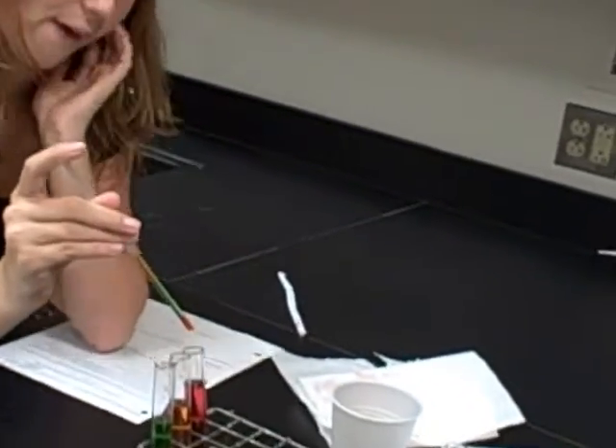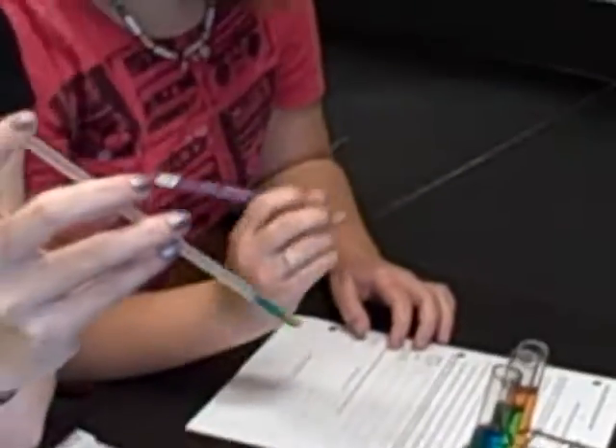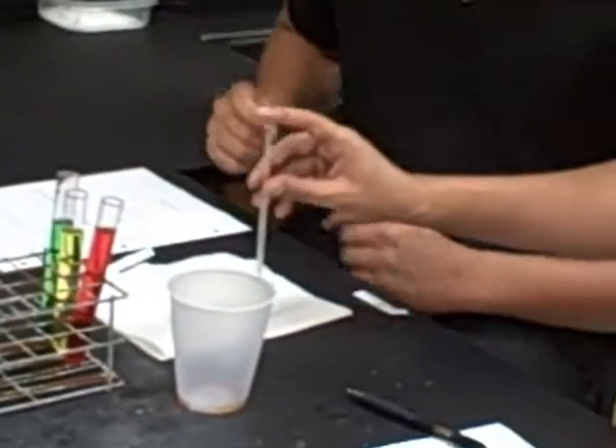Okay, so it's what on top of what on top of what? So it's blue on top of orange. Yeah, go from least dense to most dense.